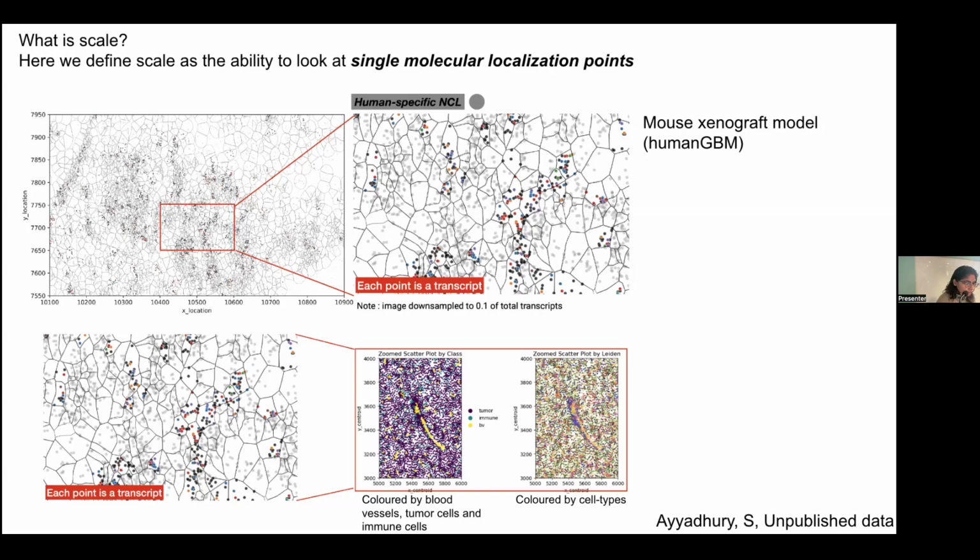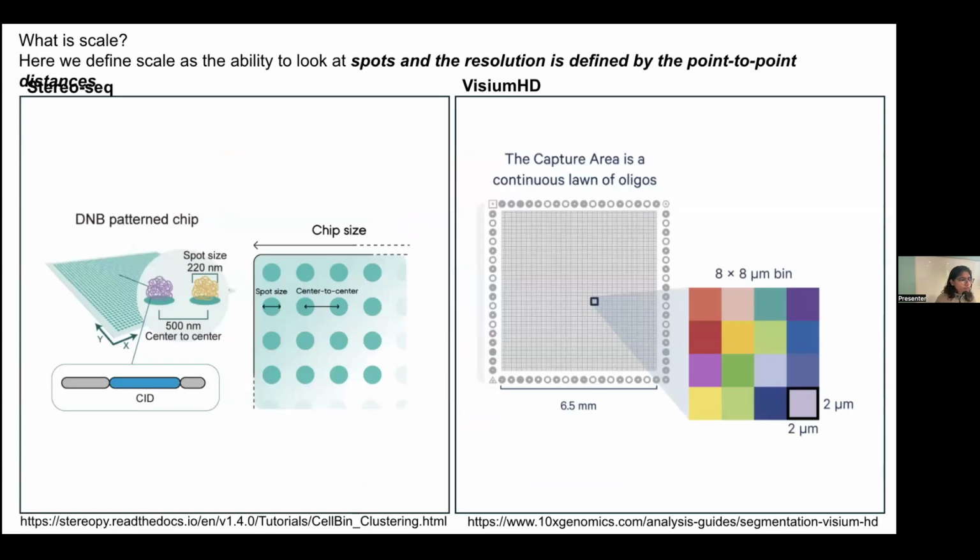And what did I want to say? Oh, and also when it comes to segmentation, there are some types of grids that are going to be easier to segment. I talked about the nature of the tissue. If you have really large cells, it's actually easier. But if you have really small cells, like immune cells, it's going to be difficult. If you're going to deal with bacteria, it's also going to be difficult. So know all these things, because all of them will affect segmentation.